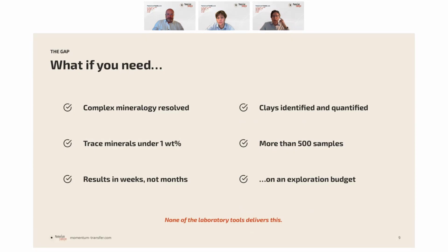Okay, so what do you need if you've got a complex mineralogy that you need to be resolved? There might be some clays that need to be identified and quantified. If you have minerals under 1 weight%, that will get difficult. If you have a huge number of samples, that'll be challenging for a laboratory device. And if you want your results with a shorter turnaround time than months, then laboratory devices will probably not deliver this for you.